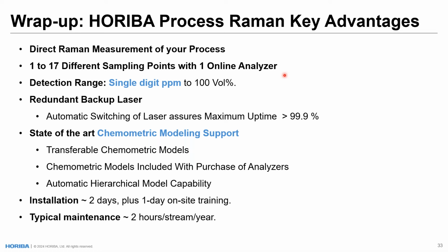Yes, our lasers, in the short term, and there will be a webinar on this eventually as well, so stay tuned. But we are currently developing a longer wavelength laser that will be able to handle darker samples like lubrication oils or also really get into amine degradation, things like that. So we are able to extend our laser wavelength options as well.